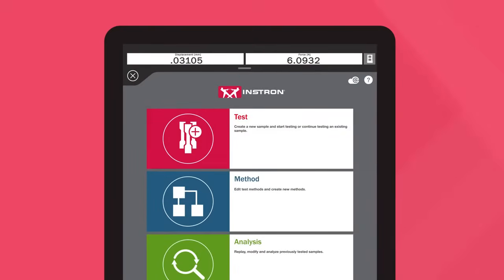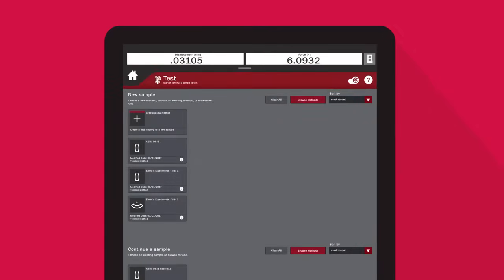Users can run a quick test, create their own method, or select from a list of pre-configured methods written to the most common ASTM and ISO standards.